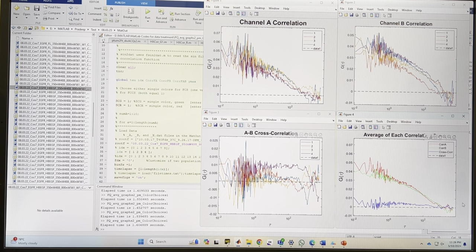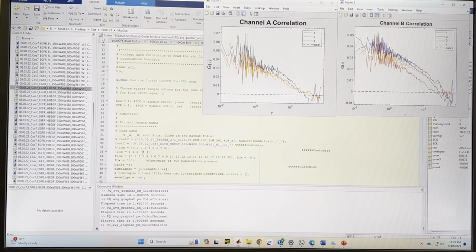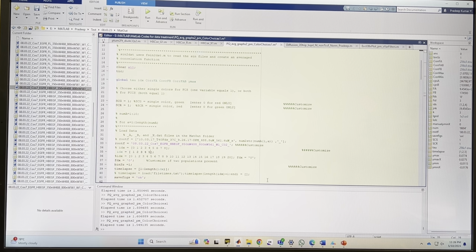So now it's looking okay. If you want, you can remove this one too, but they are looking okay for me, I guess. Because we don't want to remove more than half, so it's not a good idea to remove more. Or maybe I should remove this, which is now number 3. Let me try to remove it and see. But this is your judgment. Go with the best looking result. So now it looks much smoother, and not out of place. I took only two readings, so I will go with that.